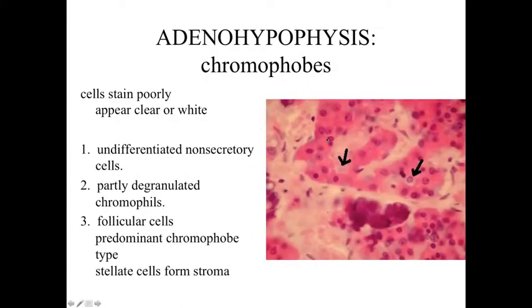The chromophobes are going to be these paler-staining cells, as outlined here with the arrows, because they don't take up the stain. There may be a variety of explanations for what these chromophobes are, but the majority of them are going to be follicular cells — stellate cells that form the stroma, the meshwork, the support framework for the entire gland. They may also be undifferentiated non-secretory cells, but the predominant ones are going to be these follicular cells.